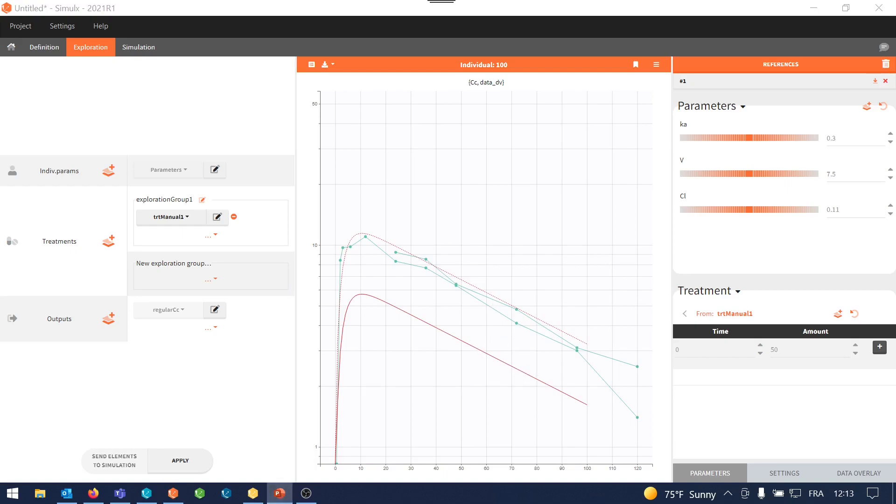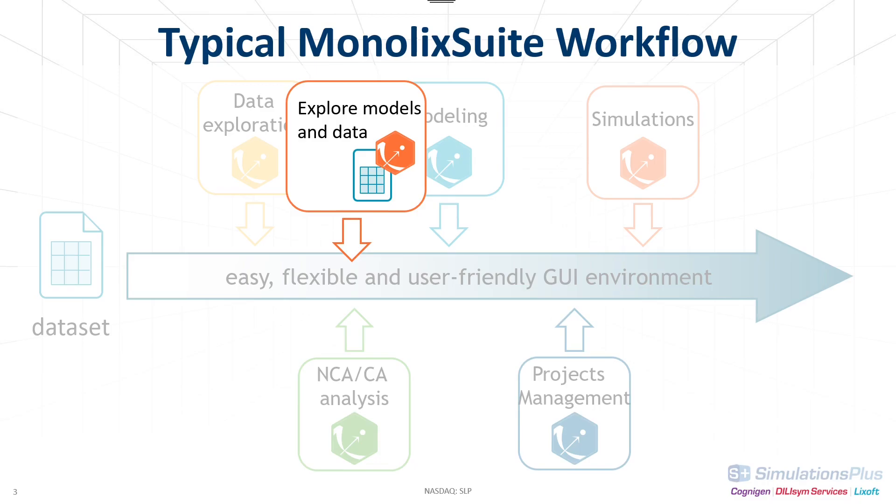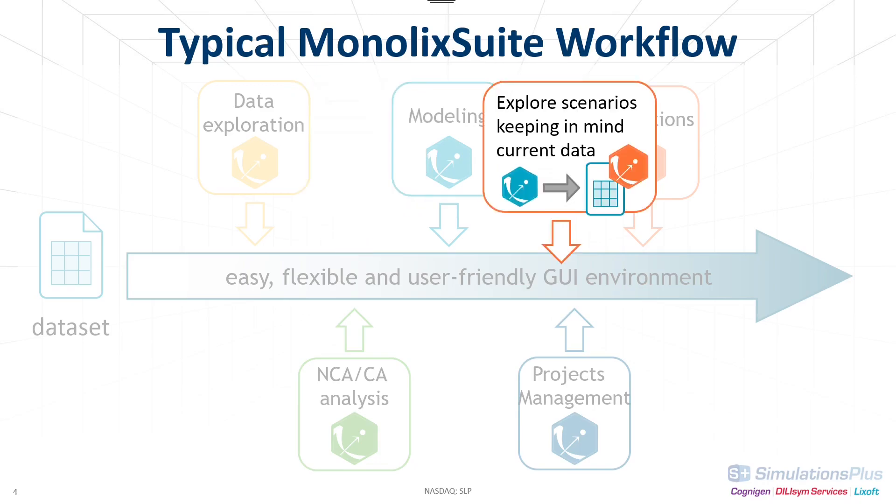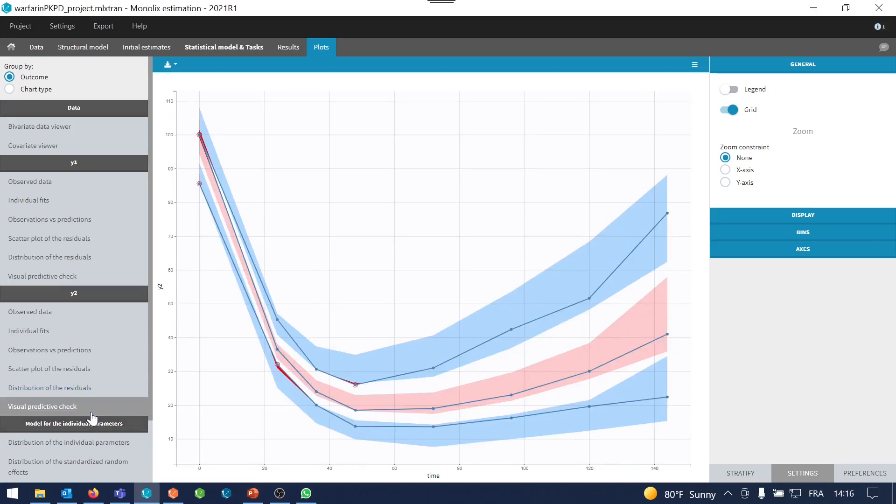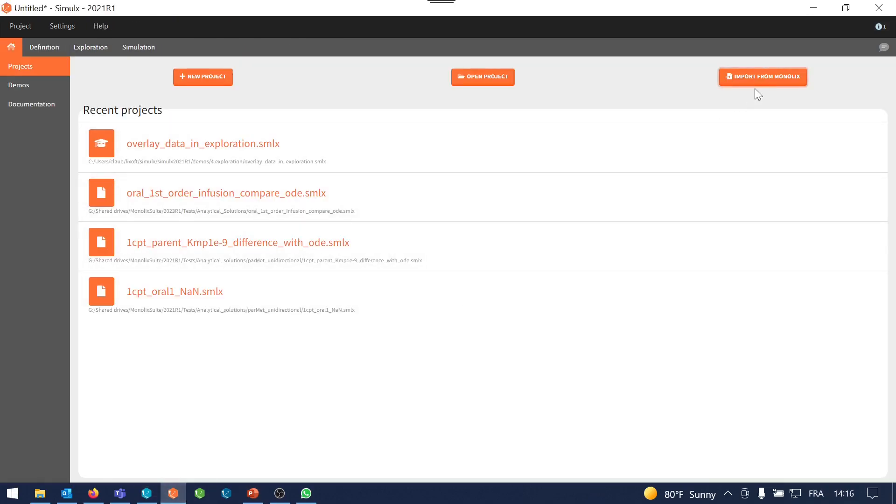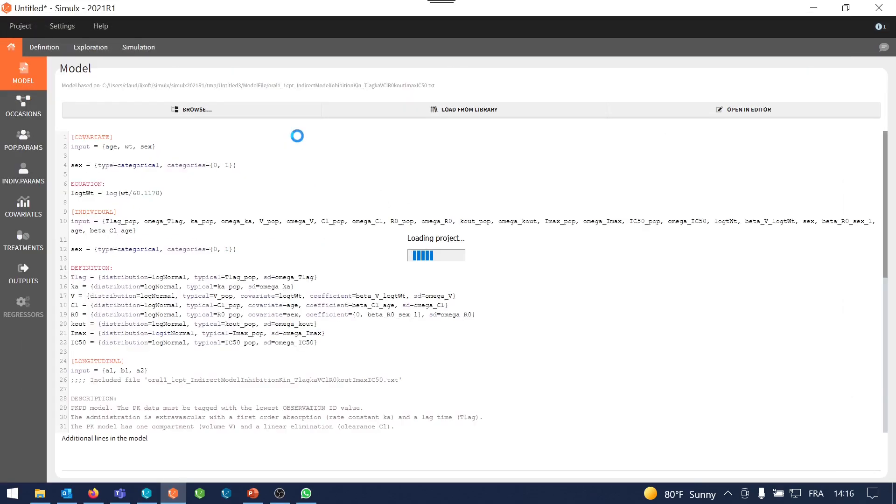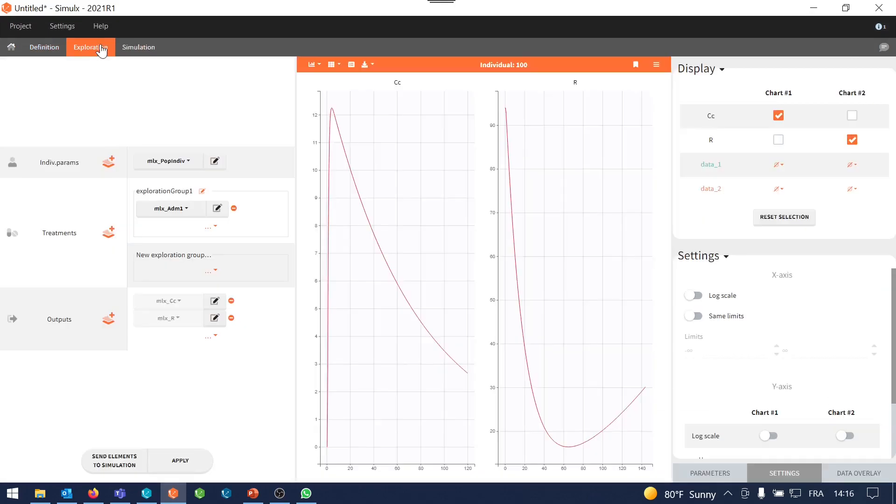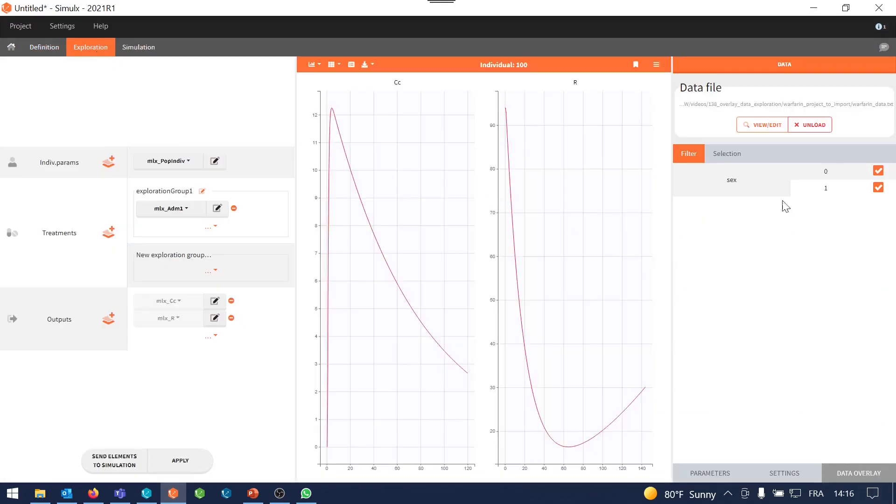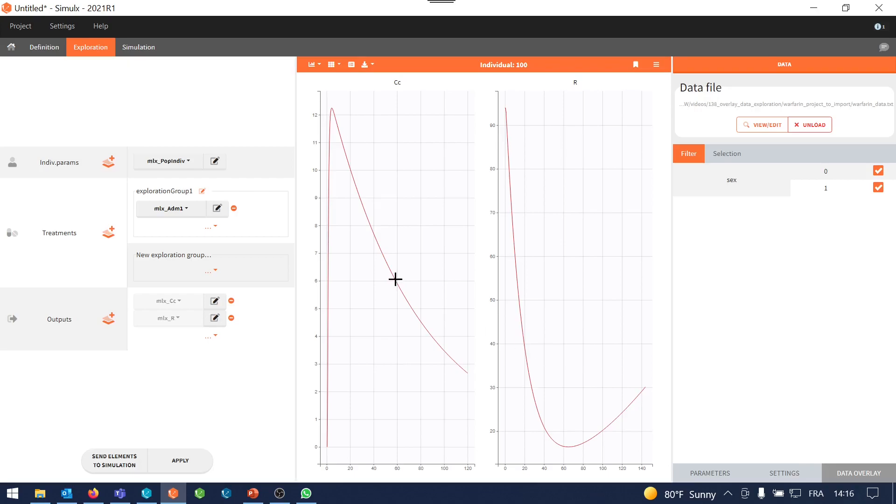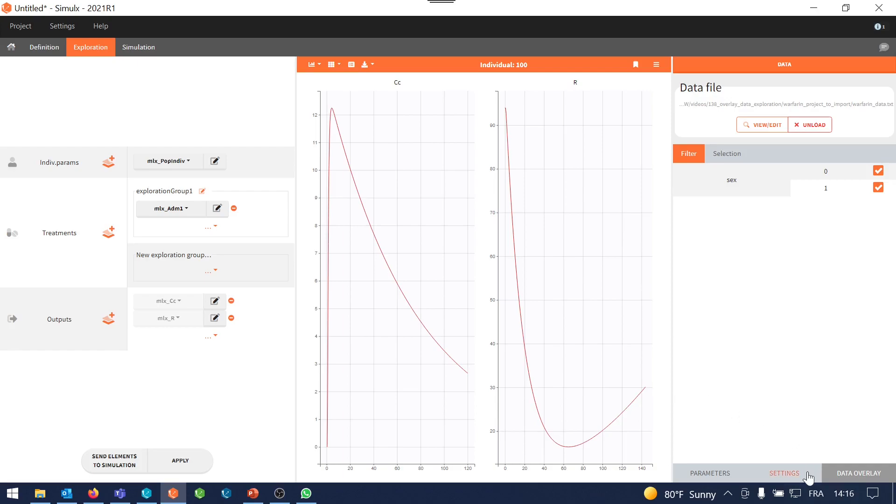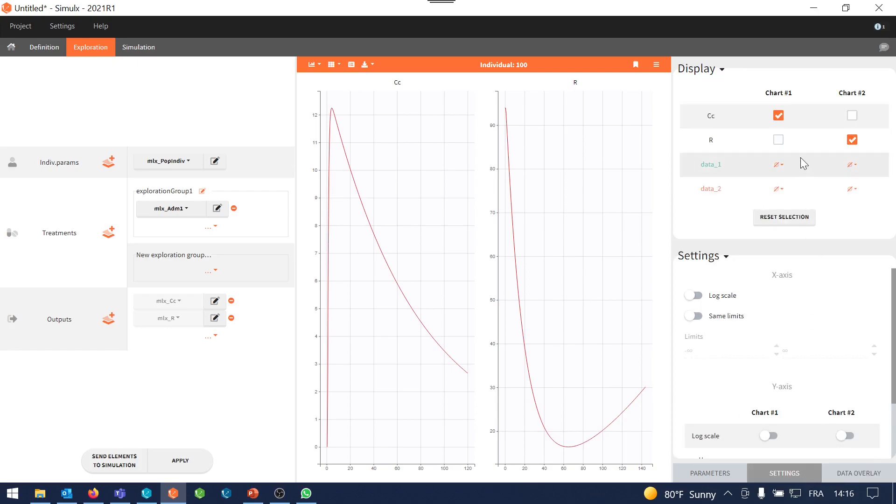So we are going to move to the second case. So imagine now that you have developed a model in Monolix and you want to explore new scenarios with this model. I have a Monolix project with a good model for the warfarin PK and PD data. Let me import it into Simulix. When I import it into Simulix, the original data is already loaded here in the data overlay section.